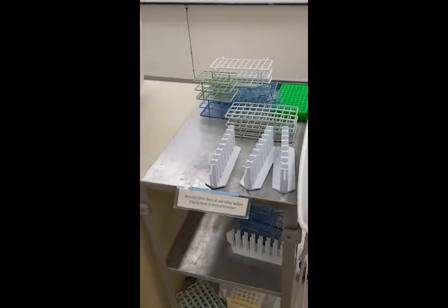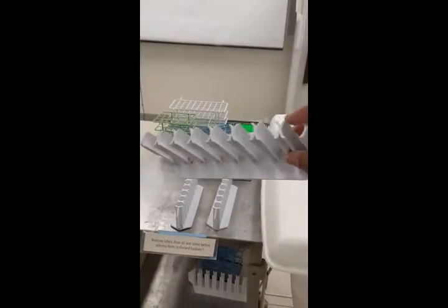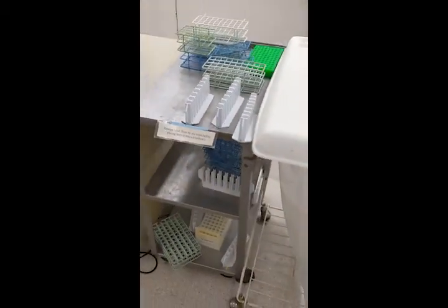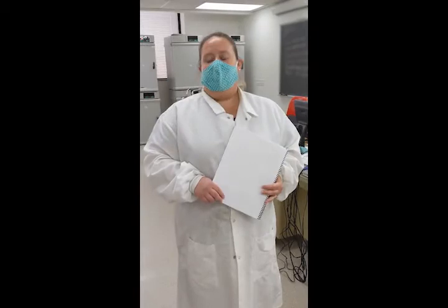Liquid cultures should always be held upright — never tilt them on their side. If you tilt them on their side, they will spill, either on your hand or all over the floor or your bench top. If you do happen to spill your culture, make sure that you contact your lab instructor.